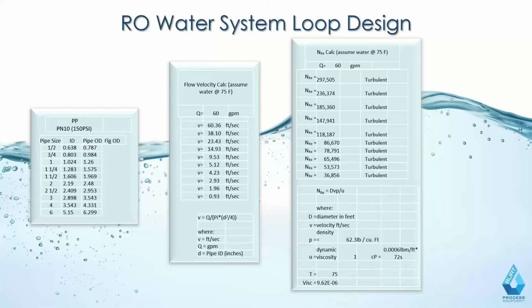But that really depends on what your water quality ends up being, but it can be anywhere as frequent as every day. In some cases, they have built-in ozonization in very high-end systems. They're ozonating the tank constantly, for example, to once a month, once every 3 months, once every 6 months. It should be done at least 2 to 4 times a year, kind of regardless of what your water quality is in those cases.